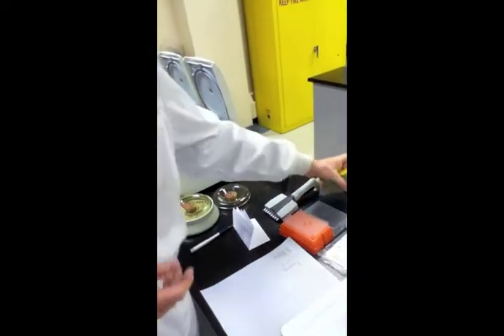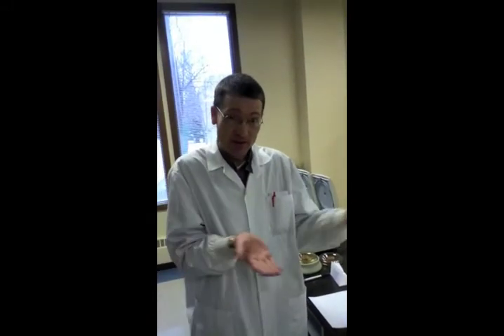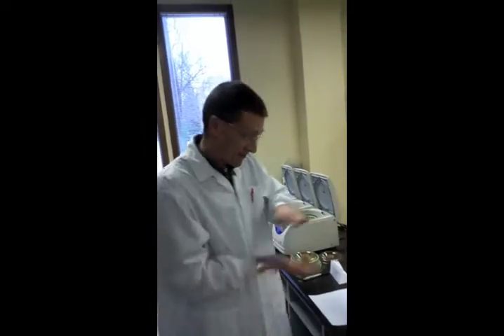Now, of course, we have to seal them, right? Because these samples are going to be boiling every cycle. Every time we start a new polymerization reaction, we have to denature the DNA strands. In order to do that, we're going to boil it. And if we didn't seal the tubes, what would happen to all the buffer? Just boil away. So we have to seal them down.